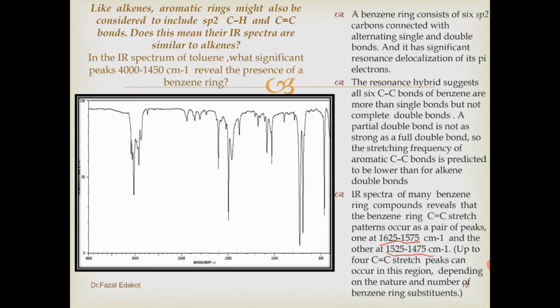So we have kept a question pending. What are the factors which influence the shape of the spectrum? Let's come back to the point later.